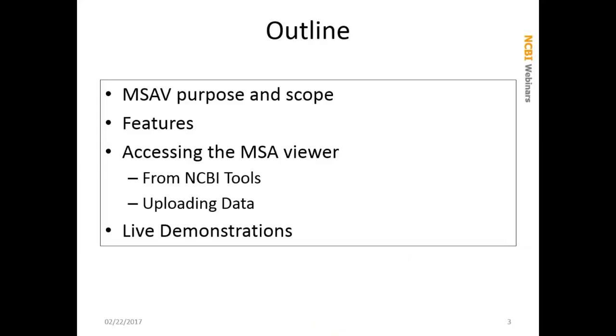So we'll talk a little bit about what the multiple sequence alignment viewer is, the purpose and scope, what its features are, how to access it from NCBI tools, how to upload your own data, and then I'll do some live demonstrations on how to do things.